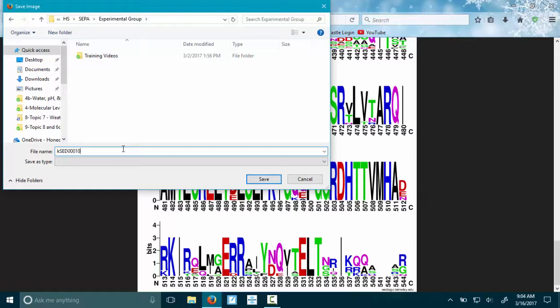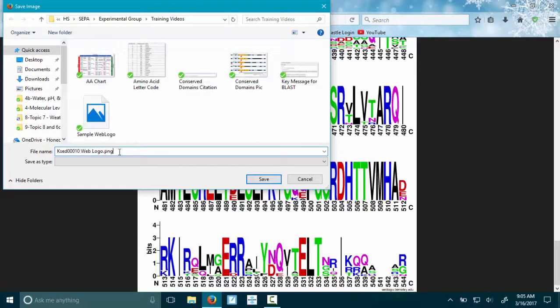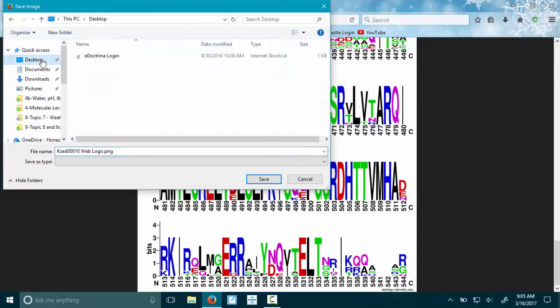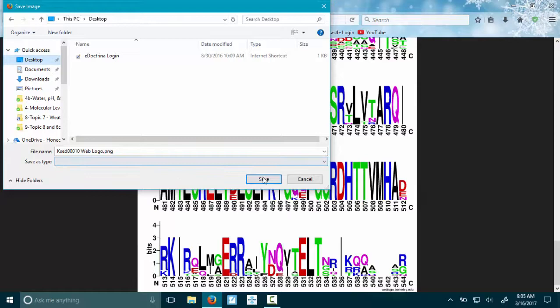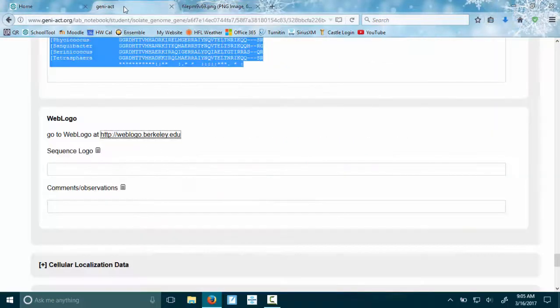I'm going to call it—I'm going to get really specific with the gene name—KAZE00010 web logo. I'm going to save it as a .png. I'm just going to put it on my desktop, which is what you should not do, because I have already done this in my sample notebook. So I'll save it, then I'm going to go back to my notebook.